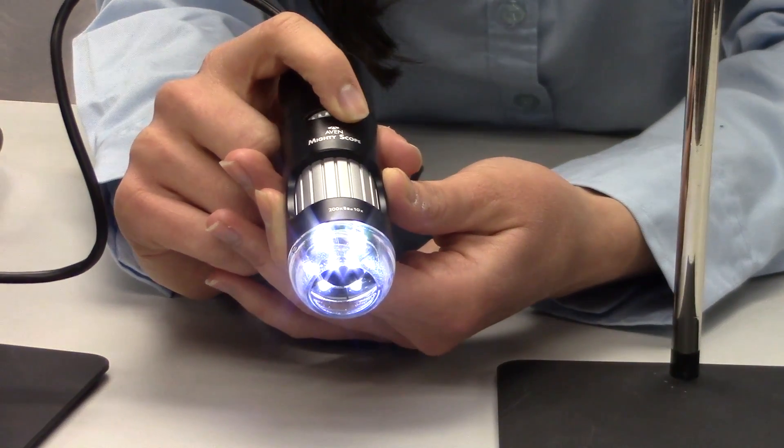Unlike many other USB digital microscopes on the market today that control light intensity remotely from the computer, all Avon Mighty Scope units feature 6 LED lights with intensity control located on the unit.